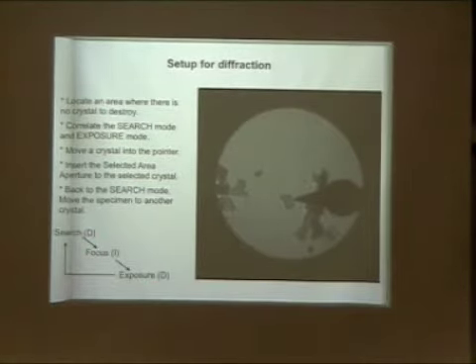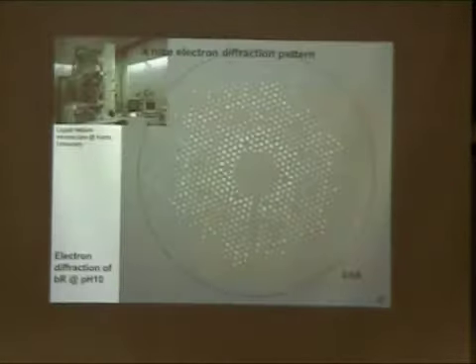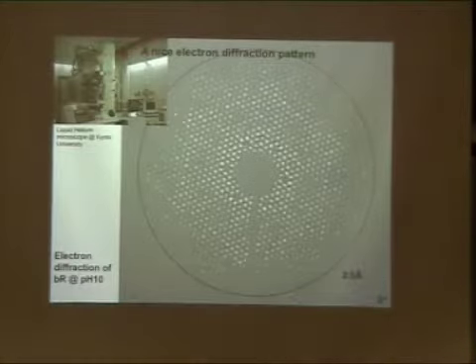We'll mention it later. So assume this is a good, beautiful 2D crystal like bacteriorhodopsin, and following this procedure, this is what you're going to get. Right? This is the diffraction pattern of rhodopsin at 2.5 Å, a little better than 2.5 Å, using Yoshi's microscope at liquid helium temperature. Now that's basically a good diffraction pattern.